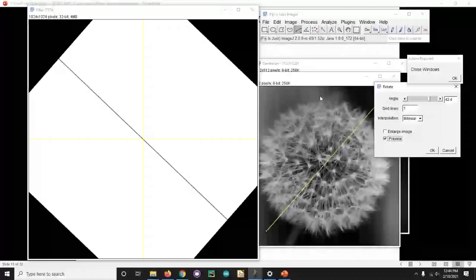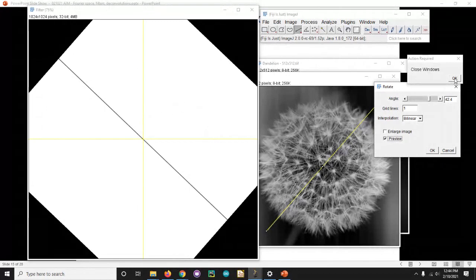So what I would actually do is I would have it make the filter on image twice as large, right? Which will give you a Fourier transform filter that's twice as big. And therefore you can remove just the middle region. And then just like I saw when I drew a selection on the Fourier transform and then removed it, you can also just multiply your filter by that Fourier transform, just to set all the background values to 1. And so this is super helpful.